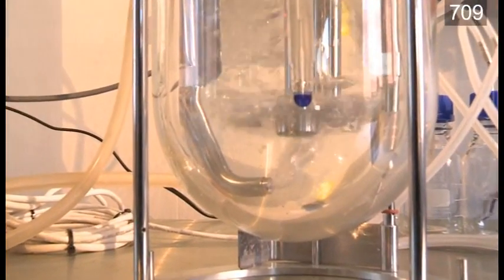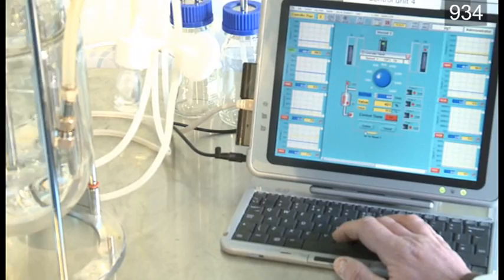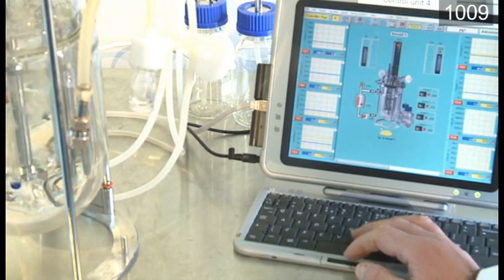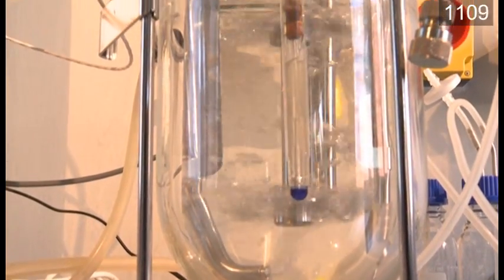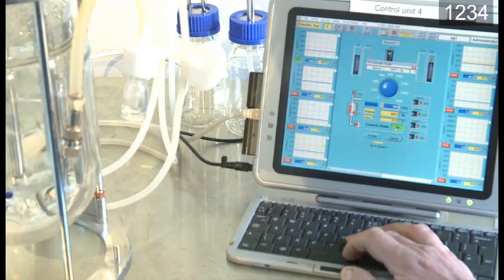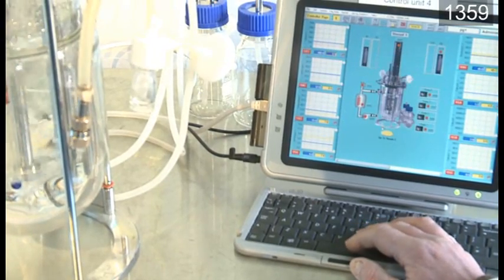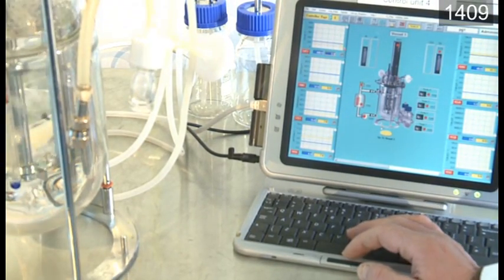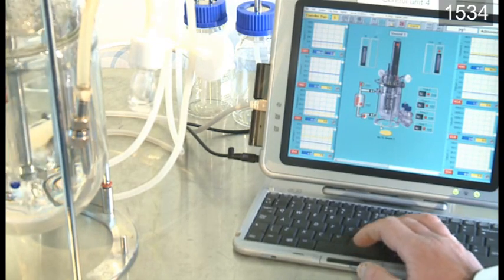What you see here is a small-scale fermenter and we use this as the initial stages of yield improvement. The fermenter itself is heated and we can control the temperature. It's aerated to maintain the oxygen level, which is imperative for the microorganism to grow. We also keep the fermentation stirred, as you can see. We can also control dissolved oxygen and pH and a number of other parameters here, and this is effectively the first stage of us increasing the yield per litre of fermentation.